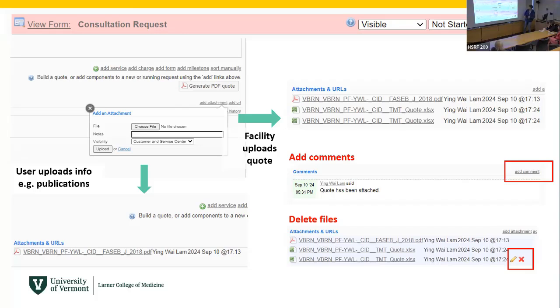And during the consultation, we usually go over a couple of things. First of all, we go over the project background. You guys are biologists. We are more technical people. We want to learn from you, and also we want to understand your biological question. Another thing is that we'll go over what kind of proteomics strategy can be offered to you. And the third is what we can realistically expect from us and what we can realistically deliver. So, a kind of managing expectations.